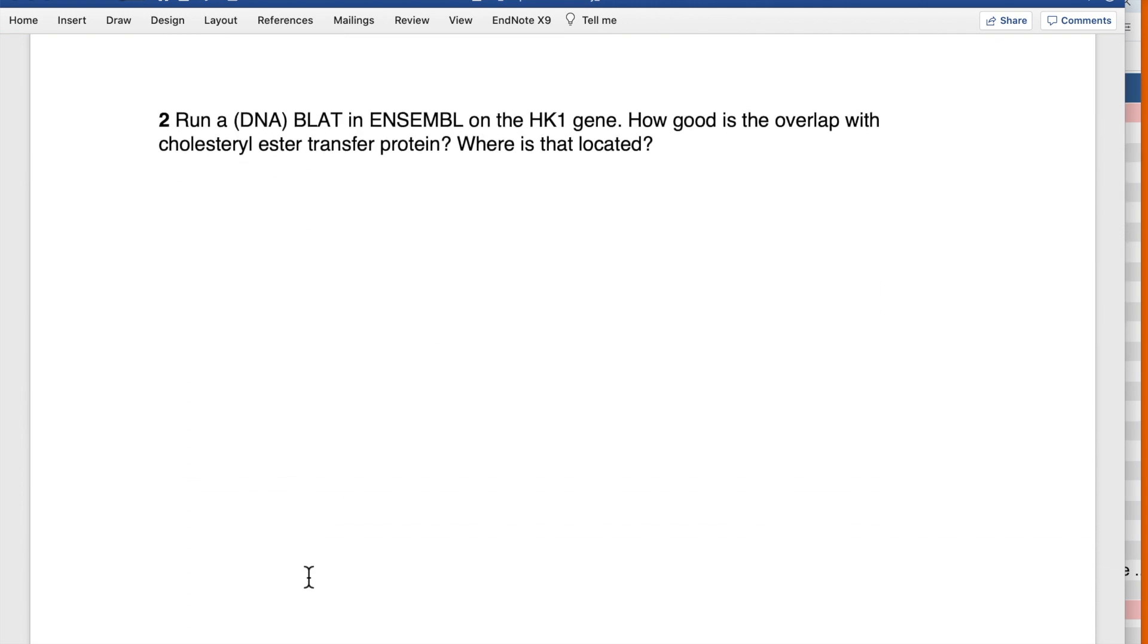Exercise two: Run a DNA BLAST in Ensembl on the HK1 gene. How good is the overlap with some protein? So we have to go to Ensembl, look for the HK1 gene, and run a BLAST on the DNA sequence.